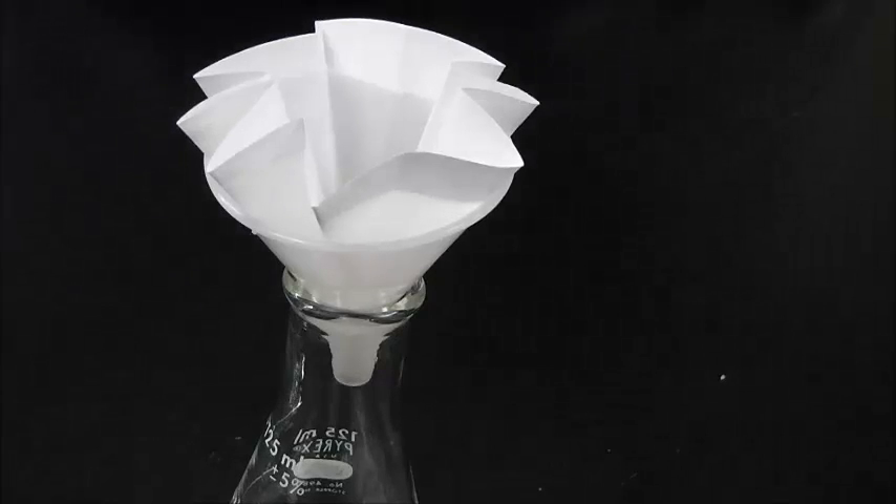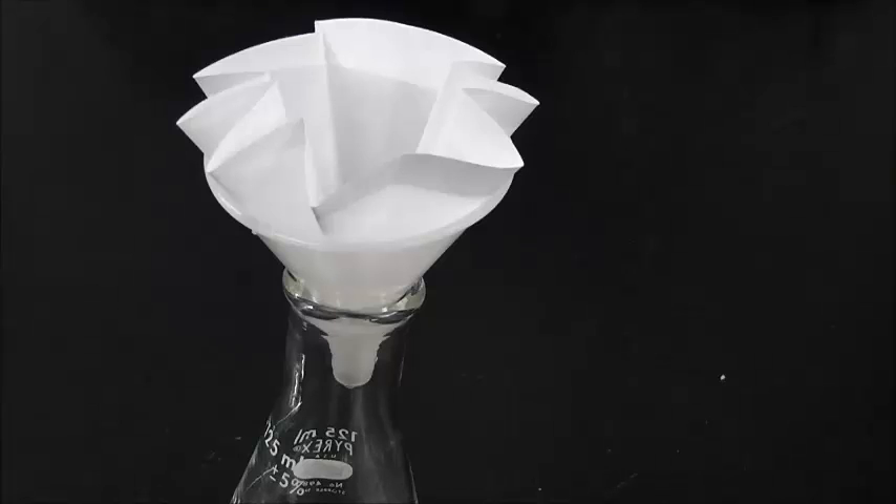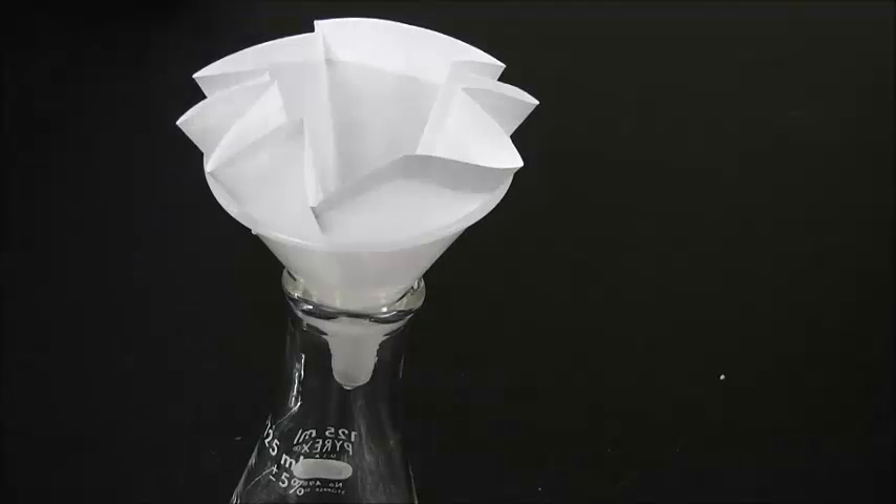Now you know how to properly fold a filter paper. Good luck, and have fun!